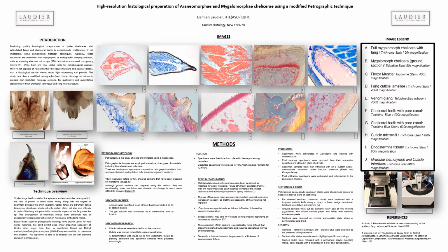So I guess the challenge, technically, if it's a larger poster, is how to construct this and keep everything aligned and make sure everything is color balanced properly. Those are the technical challenges of just constructing it, but actually doing the work that goes into the poster is something a little different. The technique of working with these tissues is certainly more challenging than actually making up the poster.